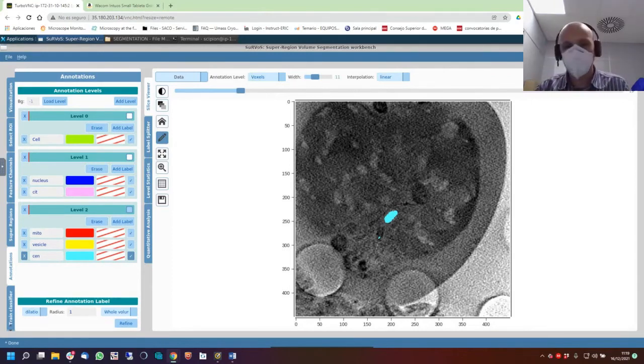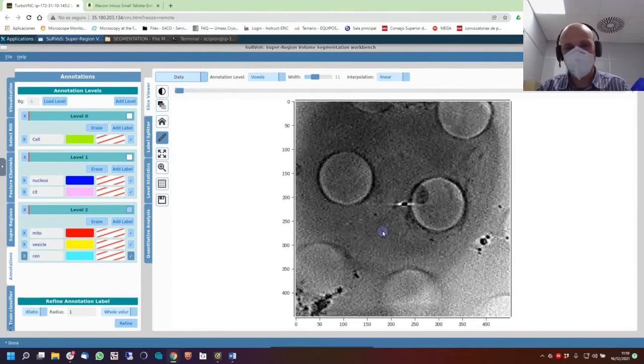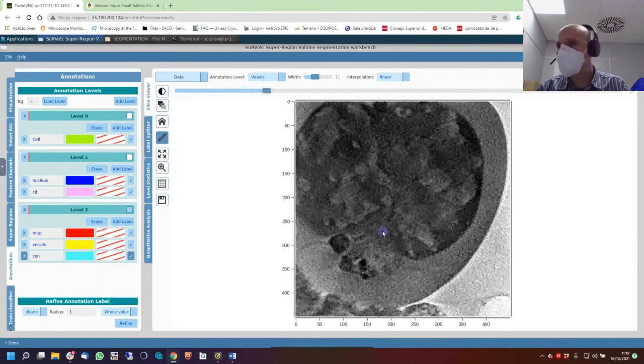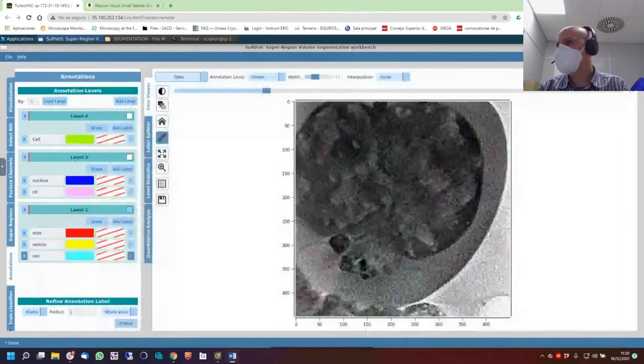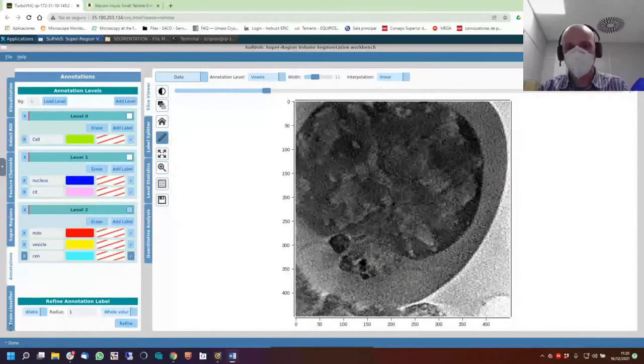Okay, you got it more or less how to play with this. So then I will give you half an hour to play and select this and play with that in order to create something more robust. Let me show you. I don't know if you did things here. Yeah, something like this, for example.